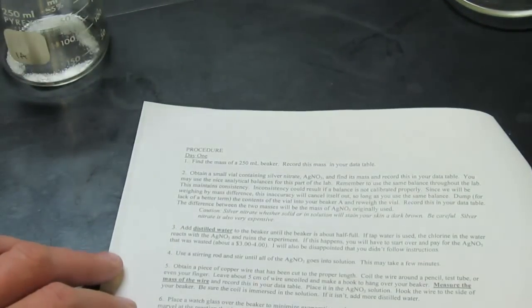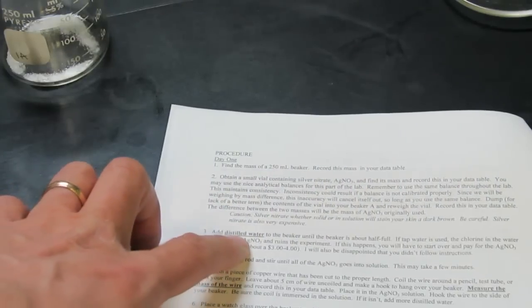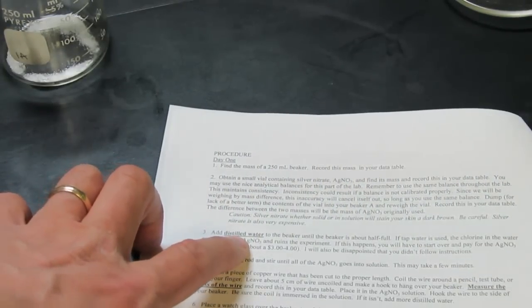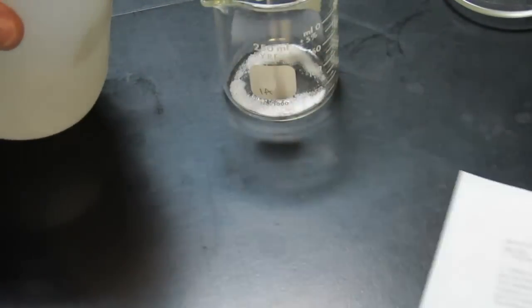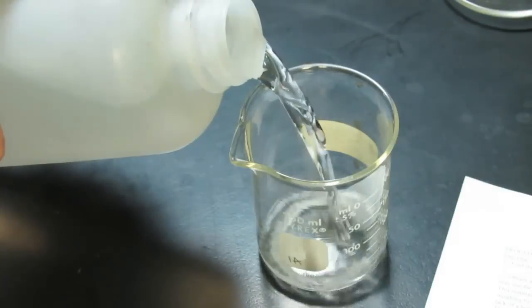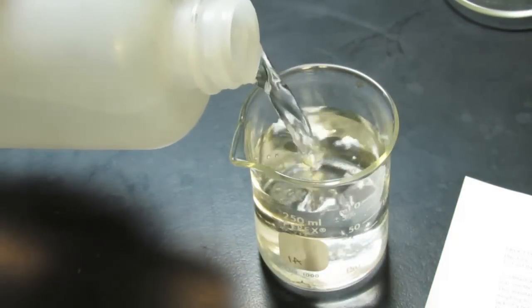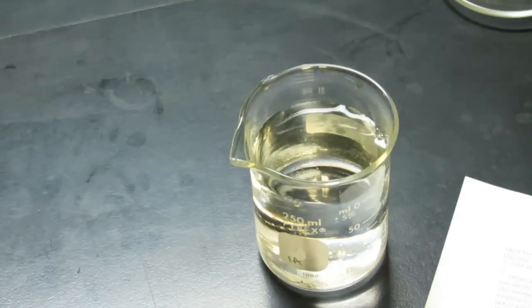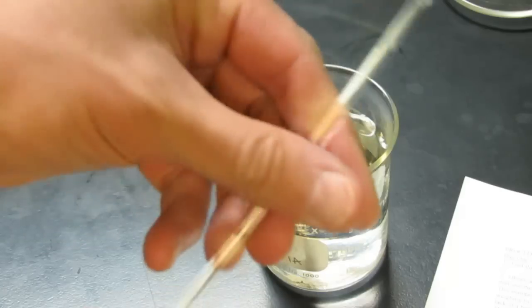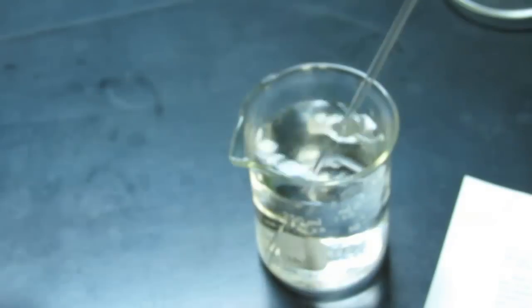Back to our instructions. Add distilled water to the beaker until the beaker is about half full. So we'll add some distilled water until it's about half full. You'll notice the silver nitrate will dissolve in the water, which is wonderful. All nitrates are soluble. We have a stirring rod to help the process along, and we'll get all of that silver nitrate dissolved in the water. We're going to set that aside for just a second.